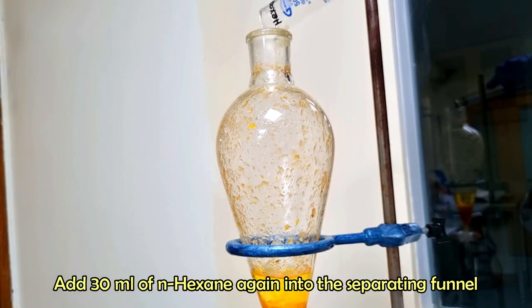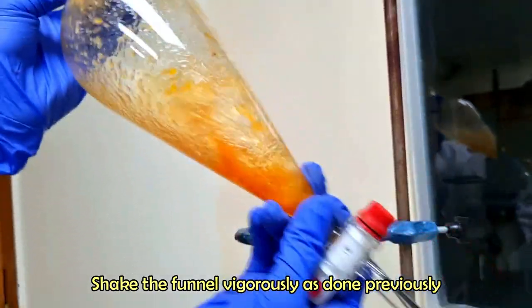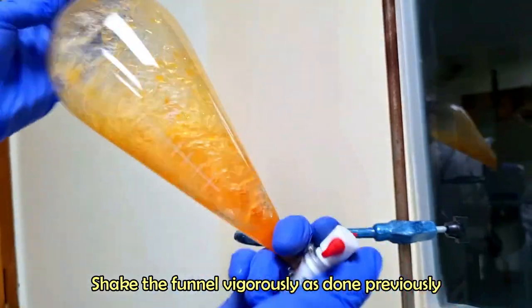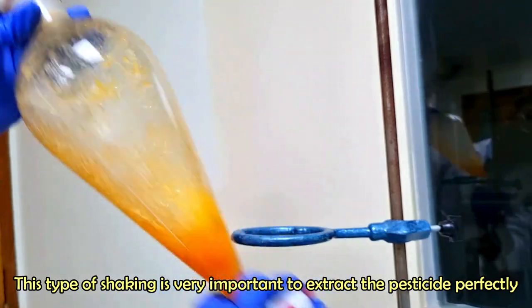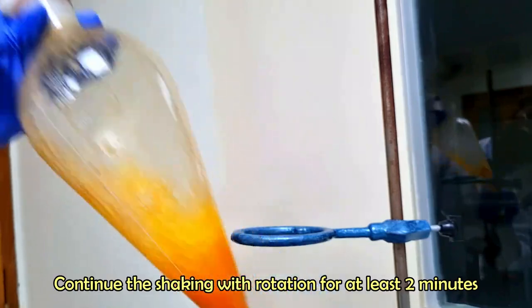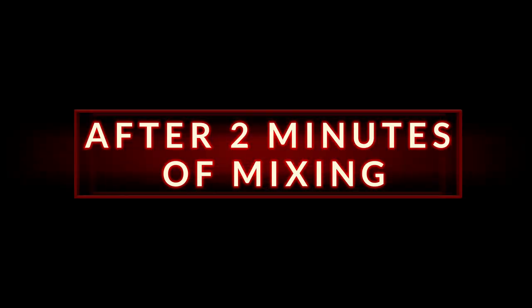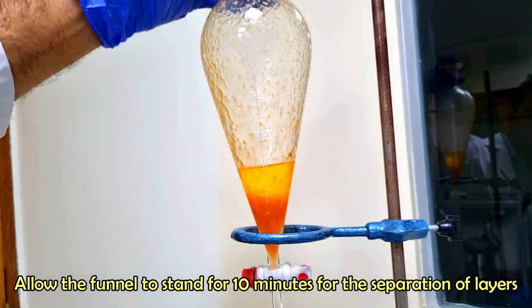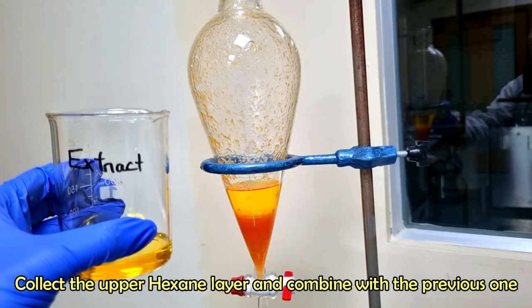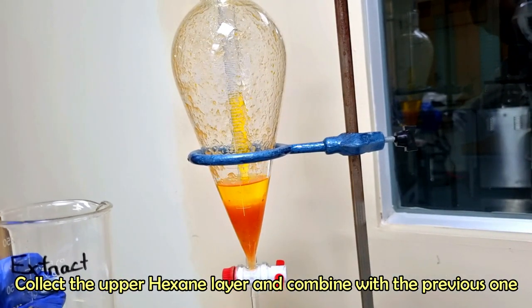Add 30 ml of n-hexane again into the separating funnel and shake for 2 minutes. Allow the funnel to stand for 10 minutes for the separation of layers. Collect the hexane layer as done before and combine it with the previous extract.